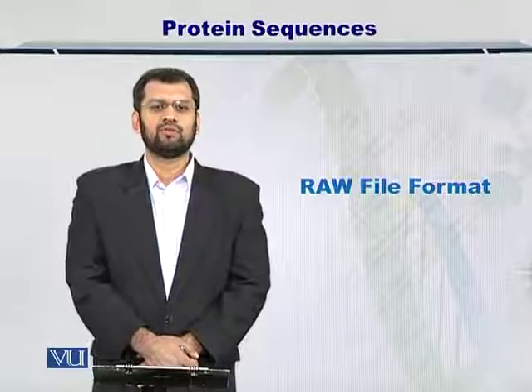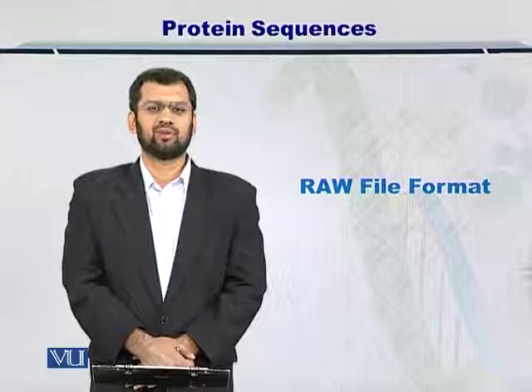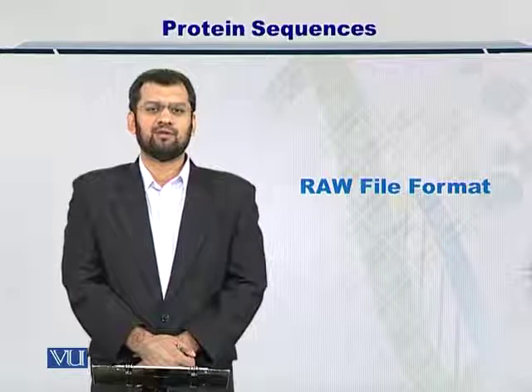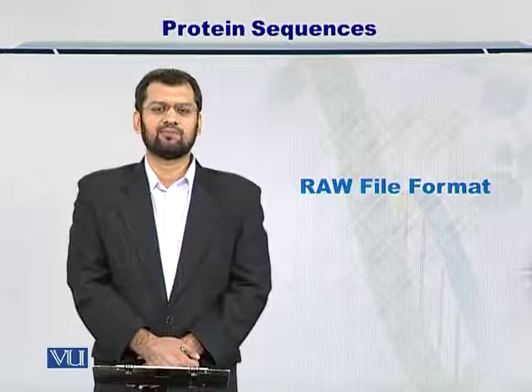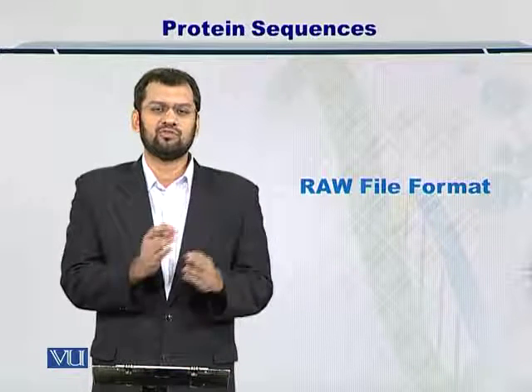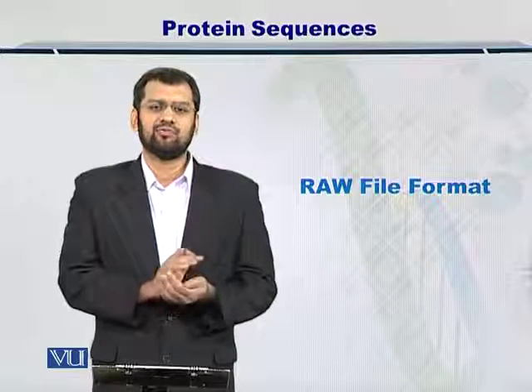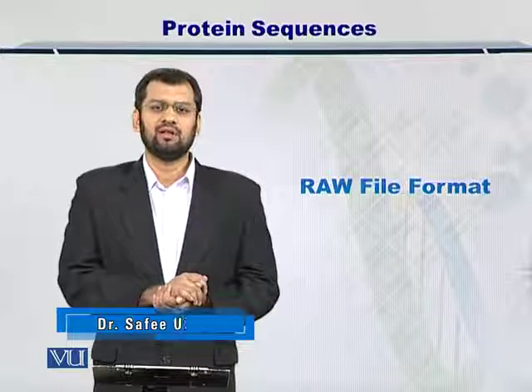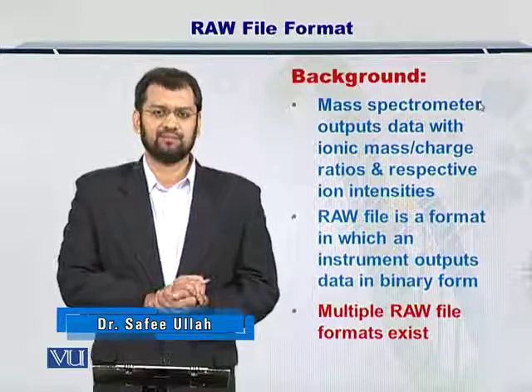Dear students, in this module, I'm going to talk about the raw file formats that are out in the market. There are many companies that fabricate these mass spectrometer instruments, which are extremely expensive at times, and they output the data obtained by using these mass spectrometers in raw file formats. These raw file formats are binary formats which are not readable by the eye. Let's take a look at them in detail.